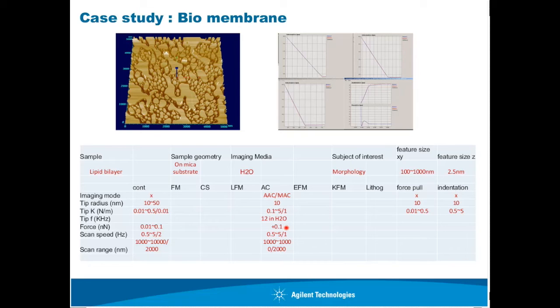You can also do force pulling and indentation using this sample, and these are the suggested cantilevers. For force pulling, you use a very soft tip, and for indentation, use a relatively high force tip. That's because a very soft tip probably cannot easily penetrate those membranes.